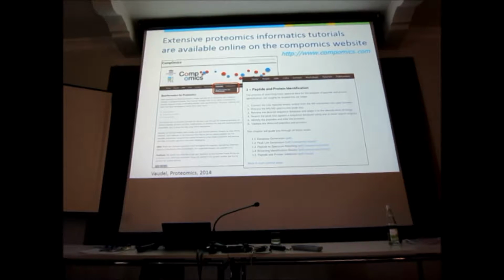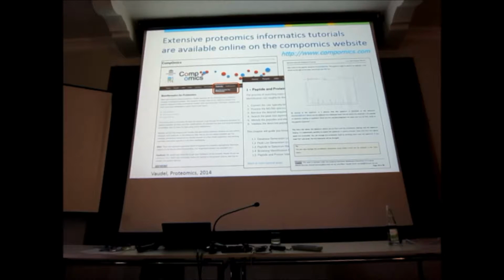How do you do the tutorials? It has the resources, so all the data you need to do the tutorial, and it has links to all the freely available tools that you can download to do the tutorial with. Plus, these tools are really not tutorial tools, they're serious research tools. So you also get all the tools, nicely organized in one place. Some of them are from my group, some of them are from other groups. And this is just to show you what these tutorials look like.